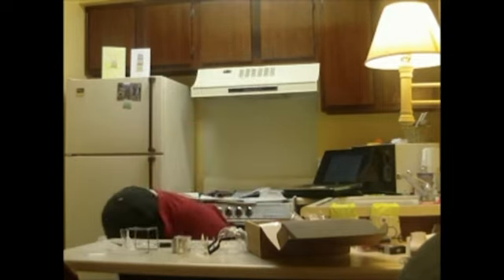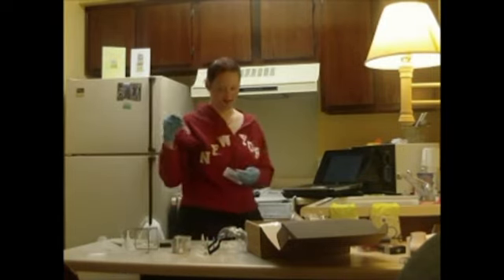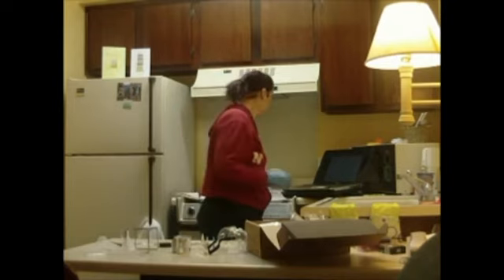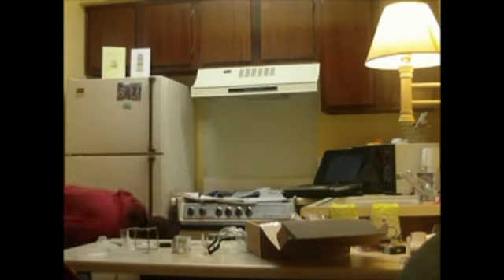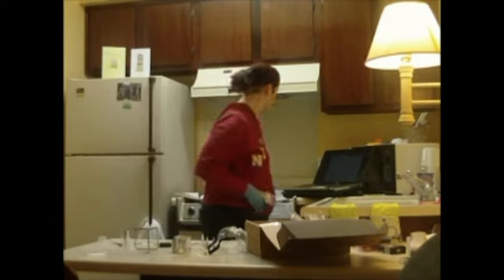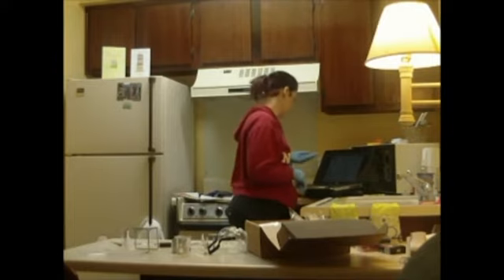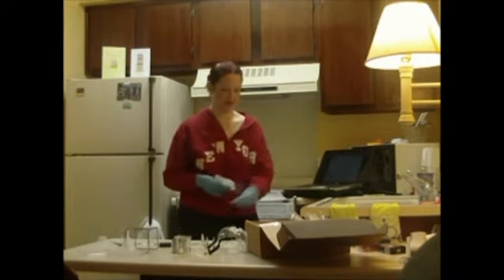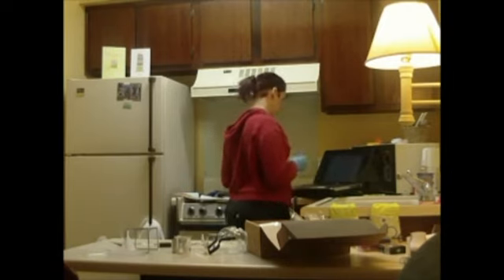Oh, how did that fall out? Okay, sodium hydroxide in the dropper bottle. Are there pipettes around here? No. Okay. Then we have zinc mossy, 6 to 8 pieces, which we have right here. So it looks like we're missing 2 pipette empty short stem.